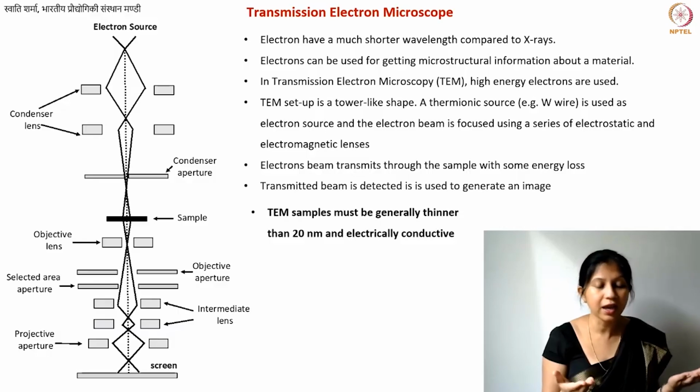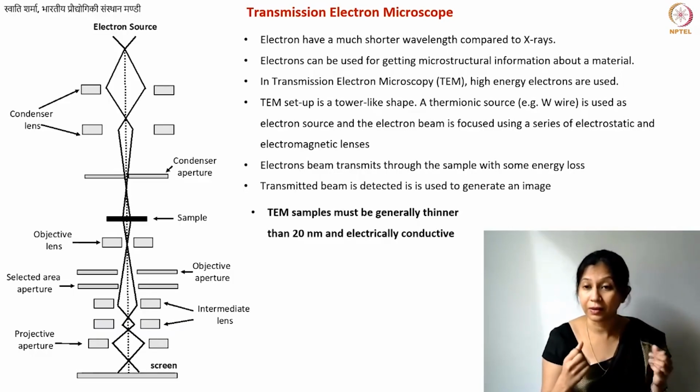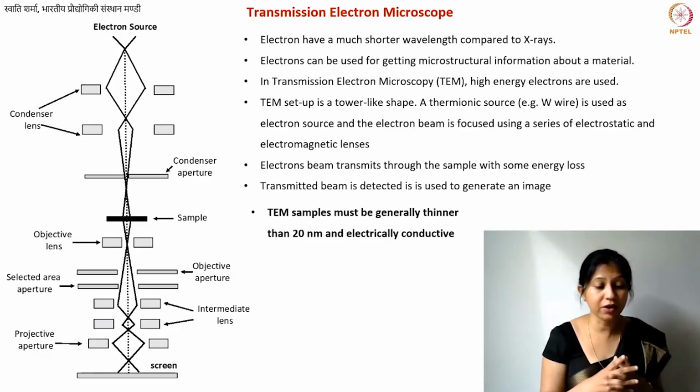You can definitely evaluate if the diameter of your tube, let's say, was 50 nanometer, or if you're using a carbon fiber. Well, often I see transmission electron micrographs of carbon fibers which are even 200 nanometer thick, or their diameter is 200 nanometer.